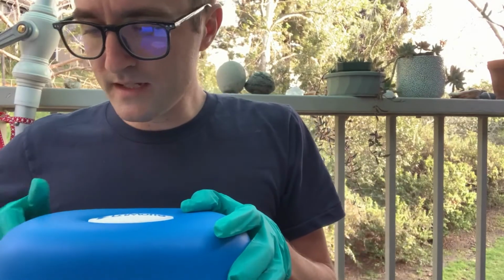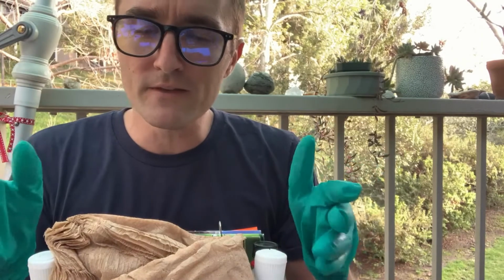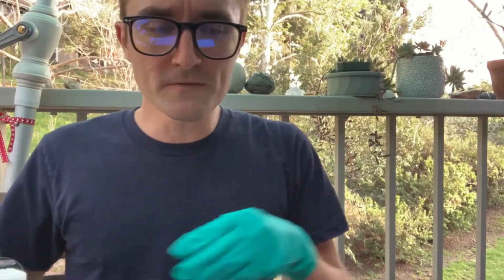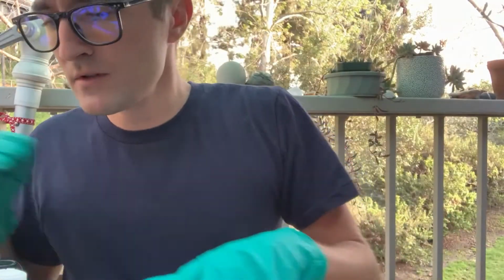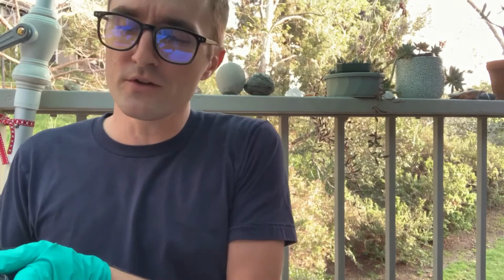When you open this kit, you will find all the things you need. Everything's here. I recommend you find a table or some place to work. Indoors is fine, but outdoors is nice just in case you make a mess. And a paper towel laid down works nicely just to make sure that everything stays clean and tidy.